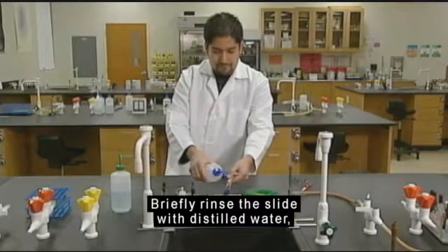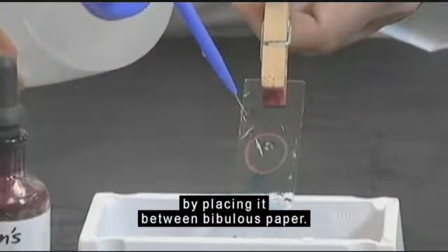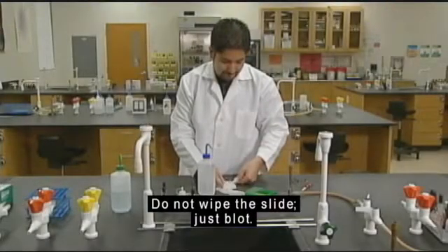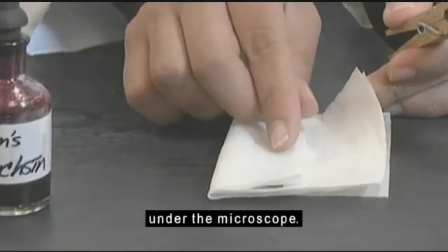Briefly rinse the slide with distilled water and gently blot the slide dry by placing it between bibulous paper. Do not wipe the slide, just blot. You can now examine your stained bacterial smear under the microscope.